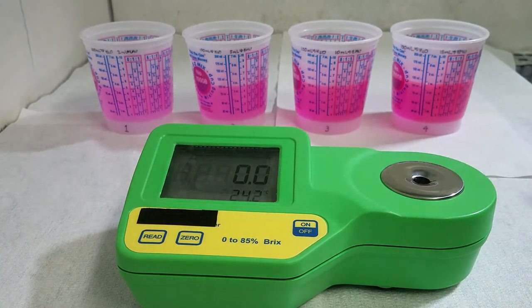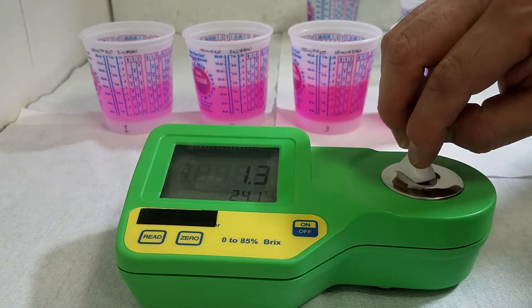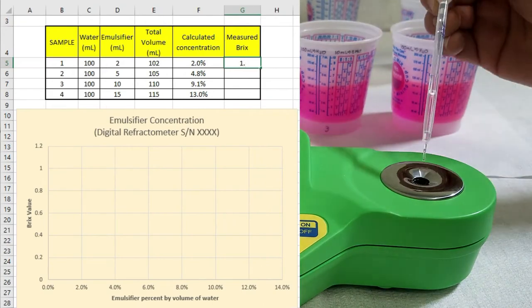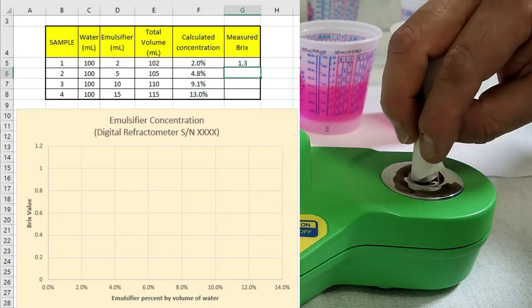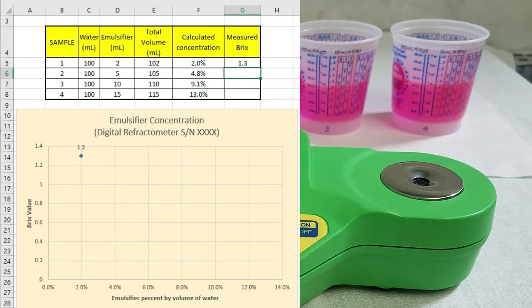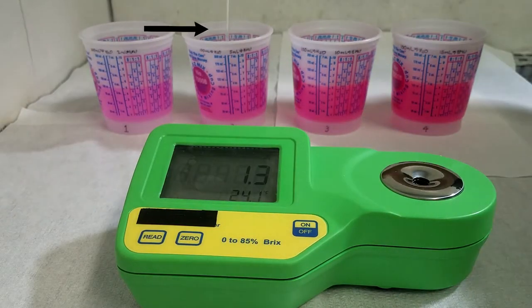Using a different and clean pipette, we are going to take the first sample and we are going to get, by pushing the read key, the value of 1.3. Feeding this value into the Excel sheet attached to this video, we are going to get the first chart point.